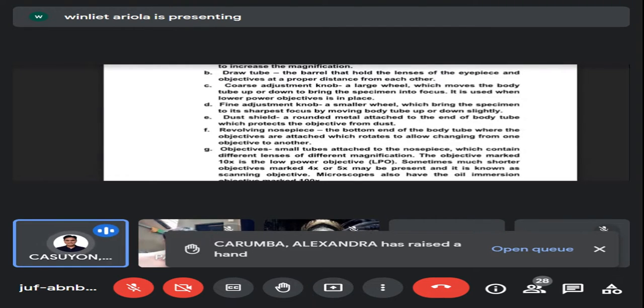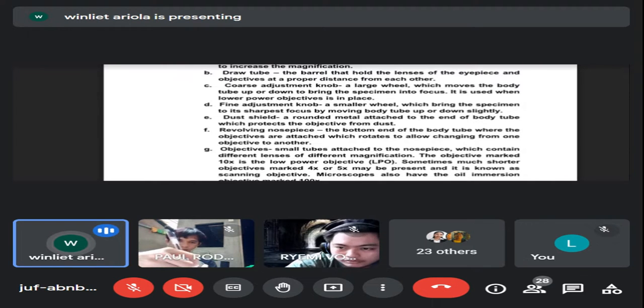Tendency po mababasag yung slide or may hit ng objectives. Yes, yung top of the slide po. Yes, correct. So may tendency na mabasag yung inyong slides kasi mahaba yung ano, 'di ba? Focus talaga yung HPO, mahaba yung kanyang objective.